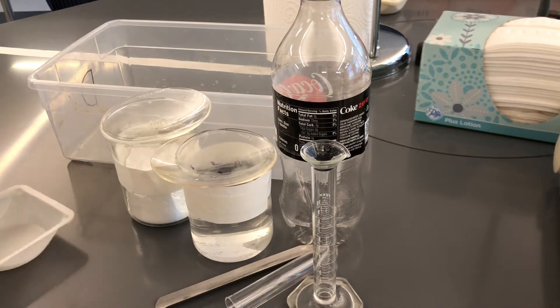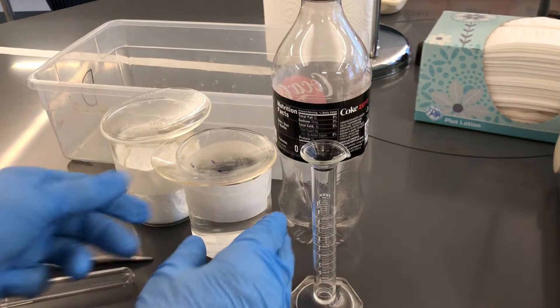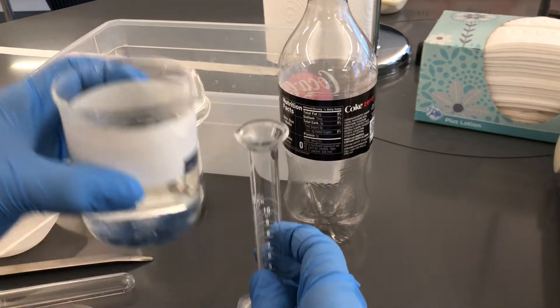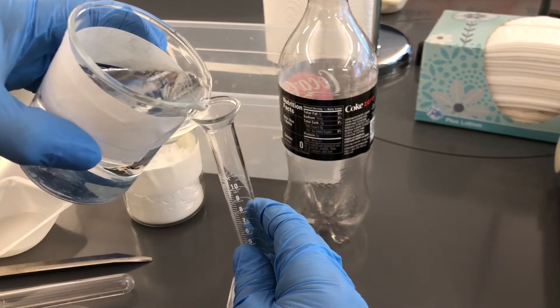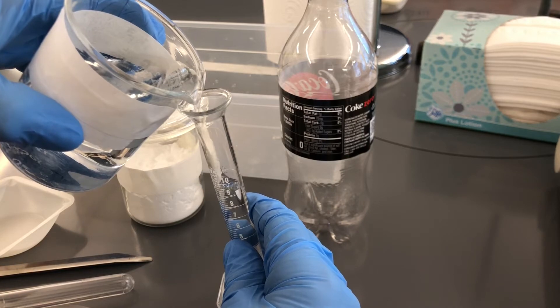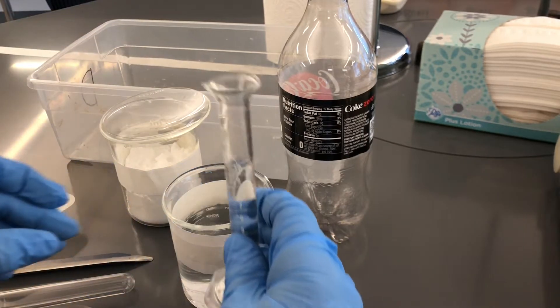And we have a weigh boat. So the first thing I'm going to do is pour some vinegar into the graduated cylinder so I can get 10 mLs — it doesn't have to be perfect but it should be close. Okay, so that's about 10.